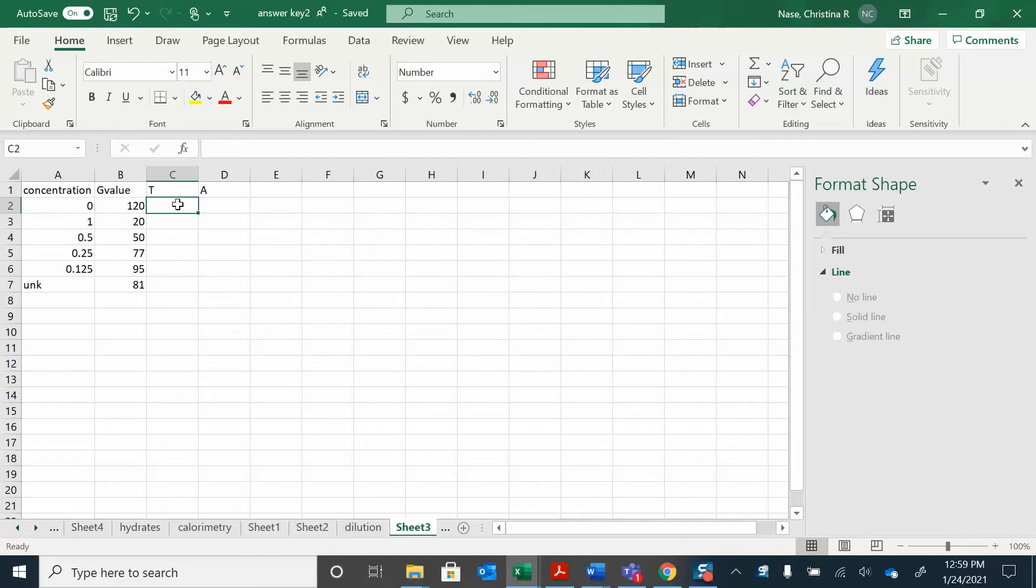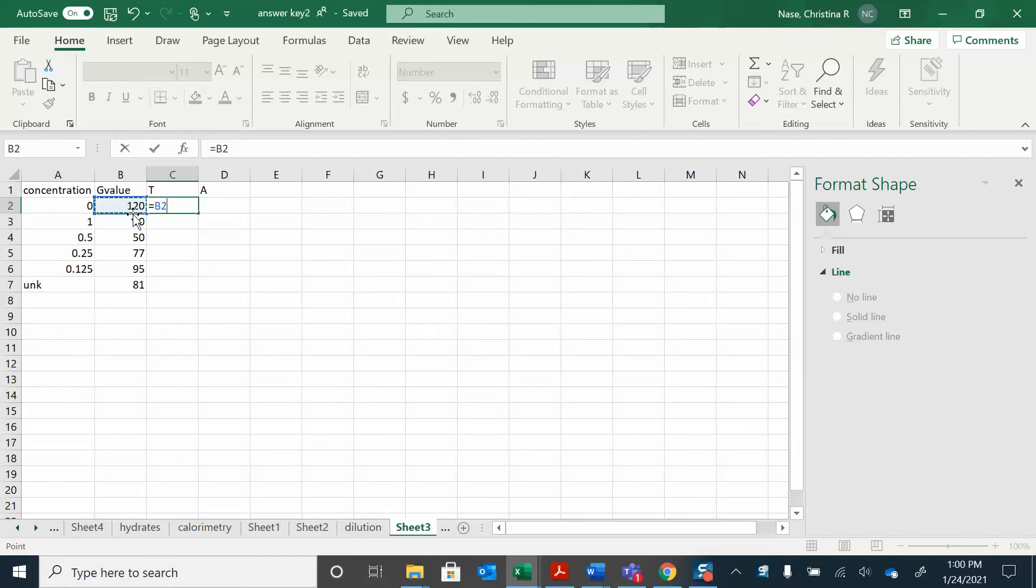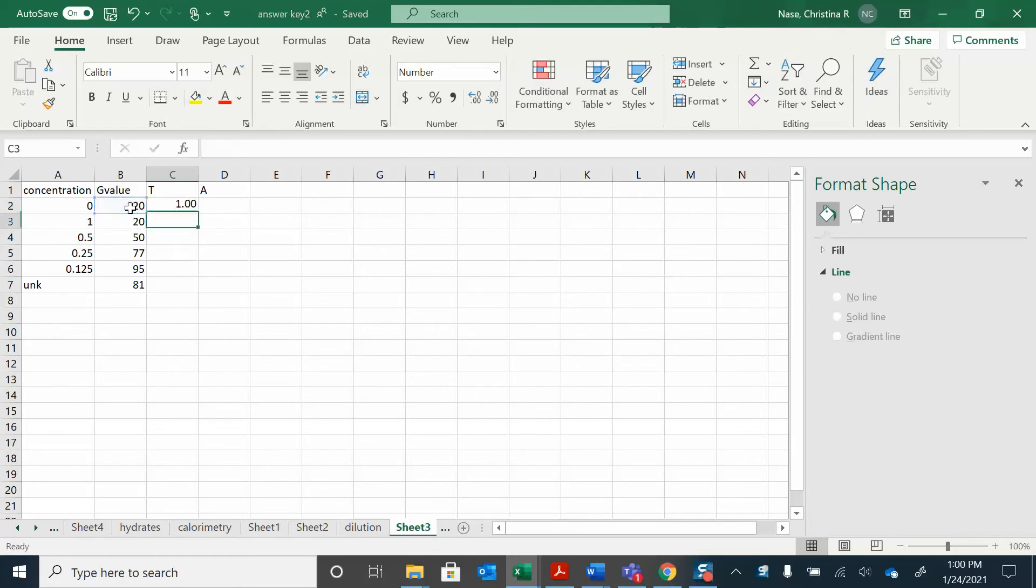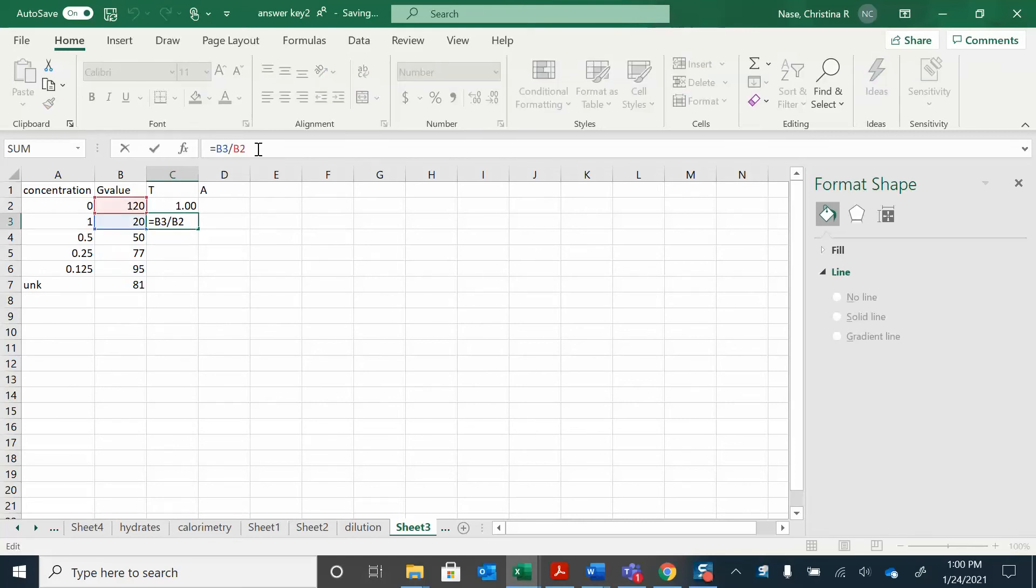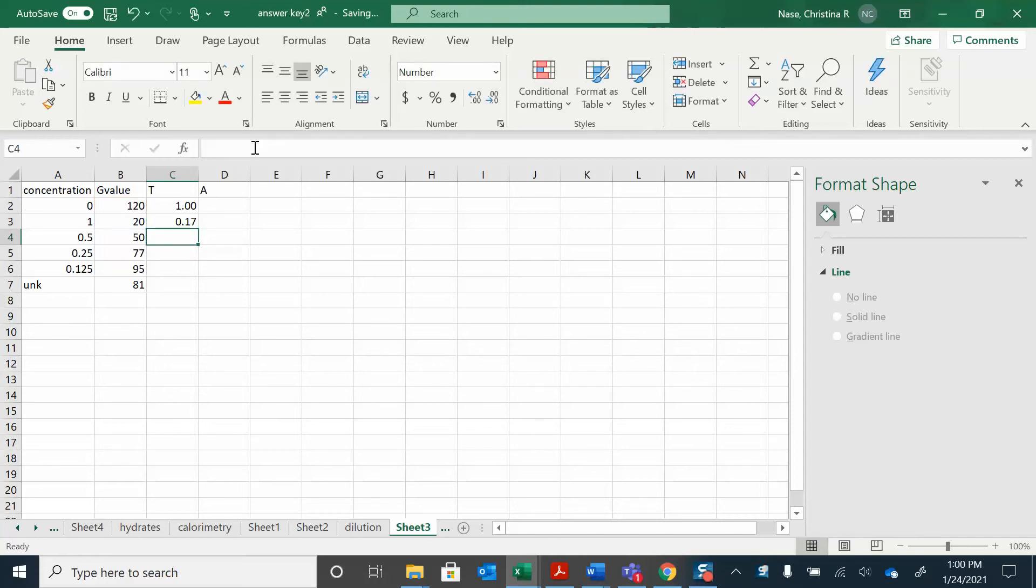So to find the T I'm going to do equals whatever the sample value is divided by the blank. So in this case it's 120 over 120. This one is this divided by 120. You can either type 120 in there or if you want to keep referencing that one cell you just put these dollar signs around for the B and the 2.